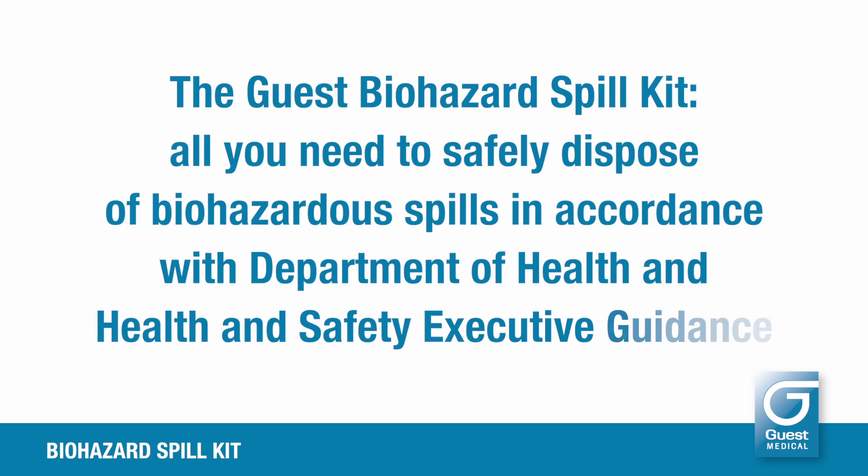The Guest Biohazard Spill Kit — all you need to safely dispose of biohazardous spills, in accordance with Department of Health and Health and Safety Executive guidance.